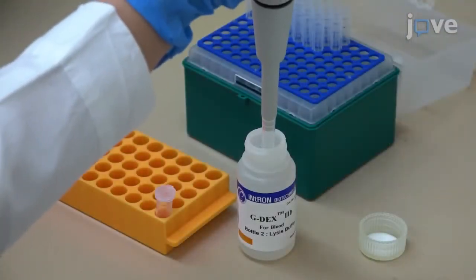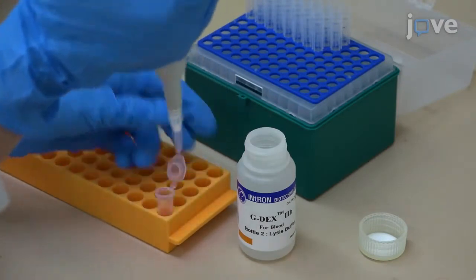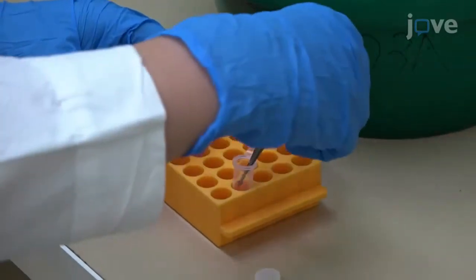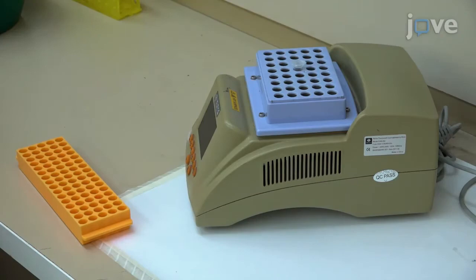Add 600 microliters of nuclei lysis solution to a sterile 1.7 milliliter microcentrifuge tube chilled on ice. Then, place a biopsy into the tube and incubate it at 65 degrees Celsius for 15 to 30 minutes.